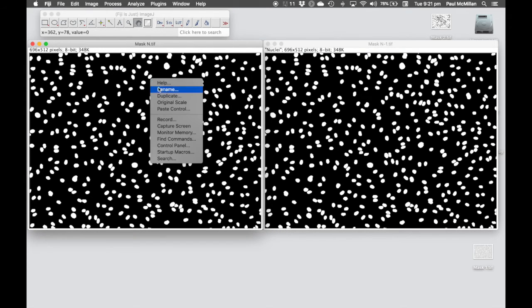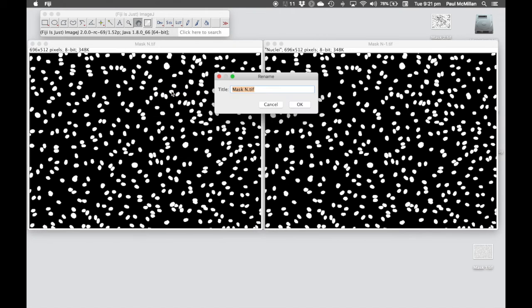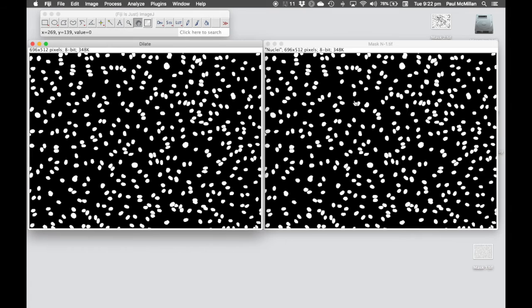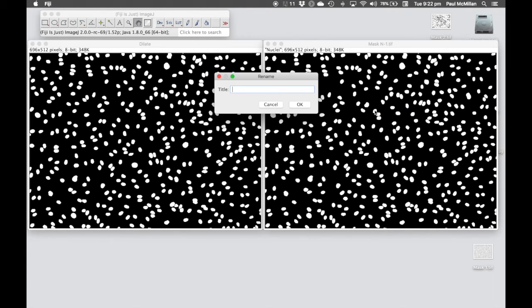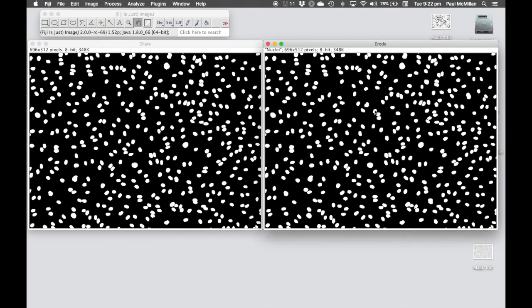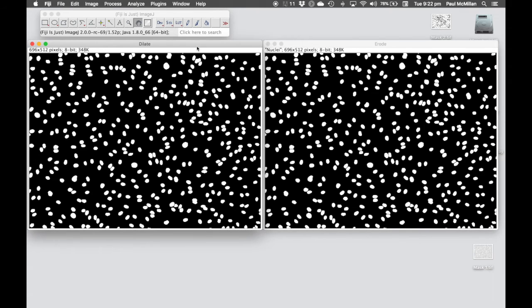And we're going to rename them. So let's rename one dilate. And we're going to rename the other one erode. And you'll never guess what we're going to do with these.